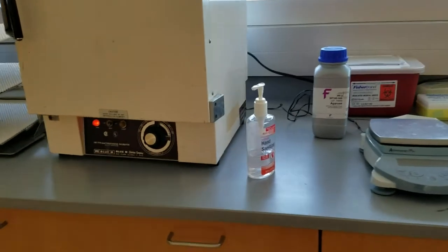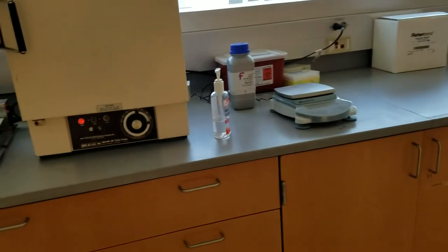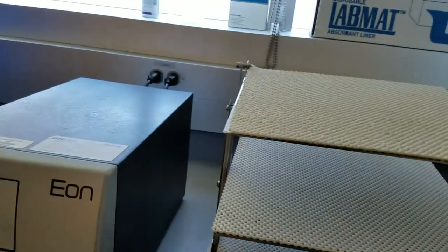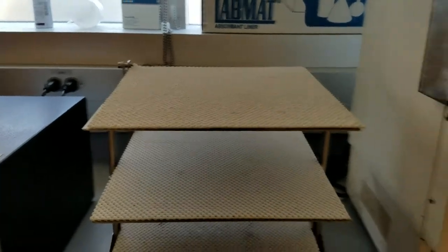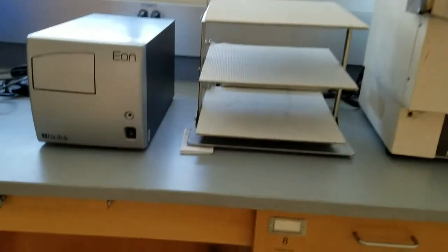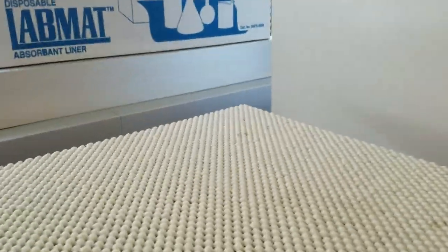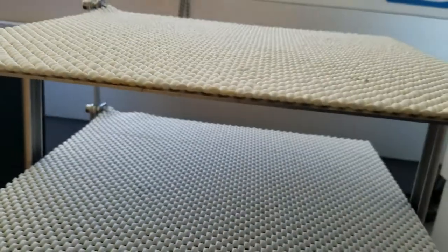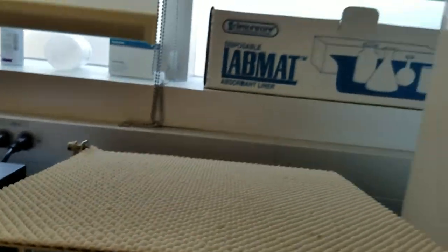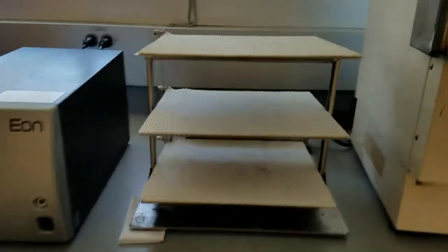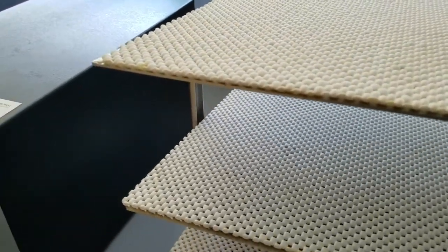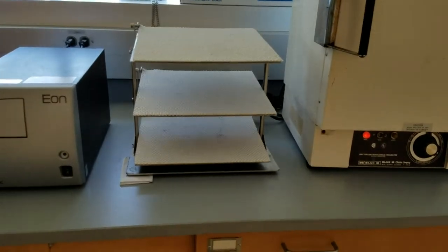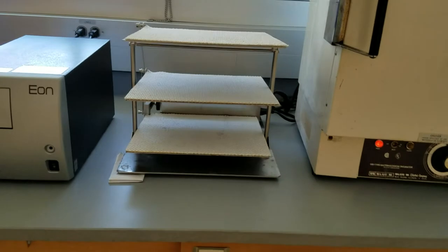Here we have a dry incubator that you can keep at various temperatures. We use it sometimes to dry out our DNA pellet and remove excess ethanol in them, and sometimes to just incubate our mixtures in there. Next this one is a rocker or a shaker that we use to mix our stuff, our experiments, gently when we need to. You can change the speed so that it can rock back and forth super fast or it can do so more gently. This allows us to incubate our antibodies and our mixtures during experimentation in a way so that it keeps them moving and mixing constantly.